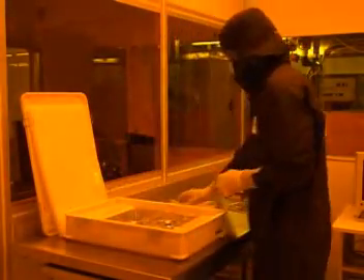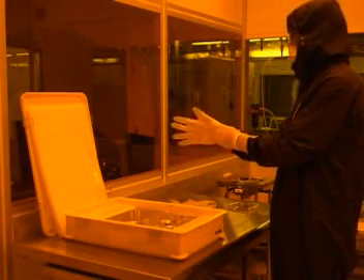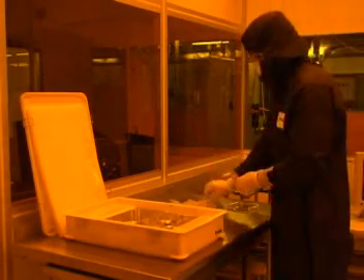Before touching the cassette, you should put on a pair of vinyl gloves which are provided in the work area. The reason for this is to try to keep the cassette as clean as possible. Even though you are already wearing gloves, there is always the possibility that they could have been contaminated with chemicals or stray particles found in other parts of the clean room.